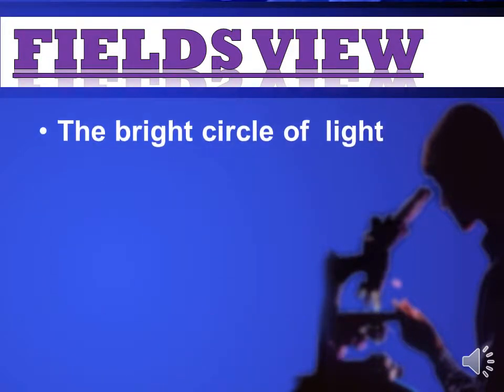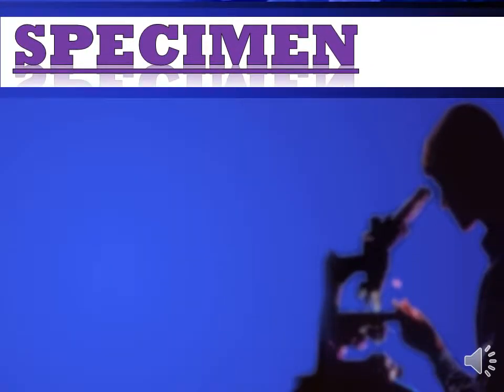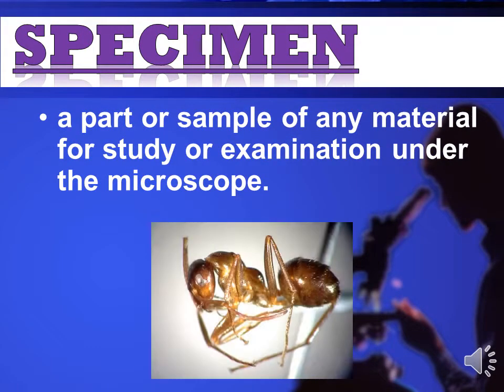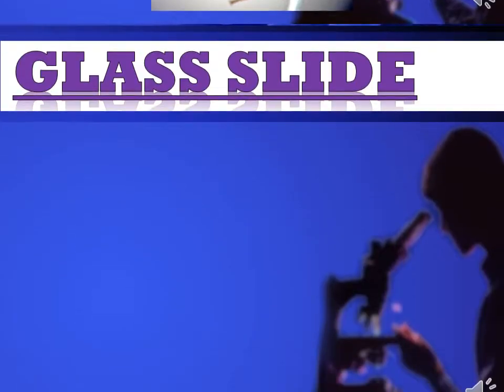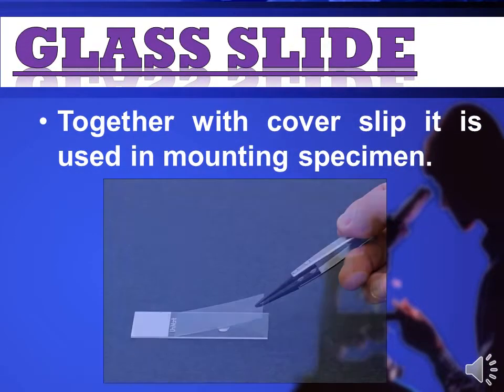Next, field of view. It is the bright circle of light where the specimen is observed under the microscope. Specimen is a part or sample of any material for study or examination under the microscope. Lastly, glass slide. Together with the cover slip, it is used in mounting the specimen.